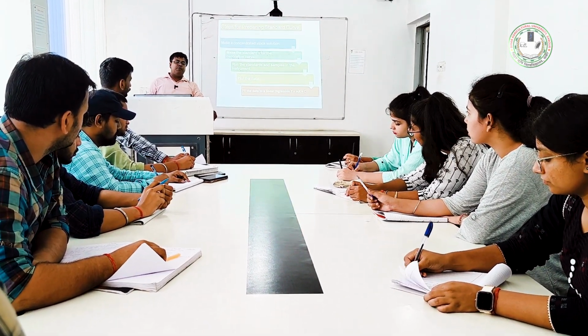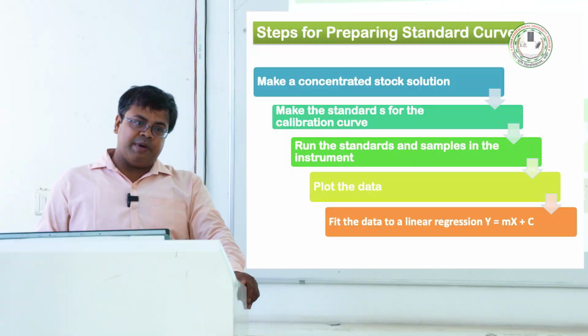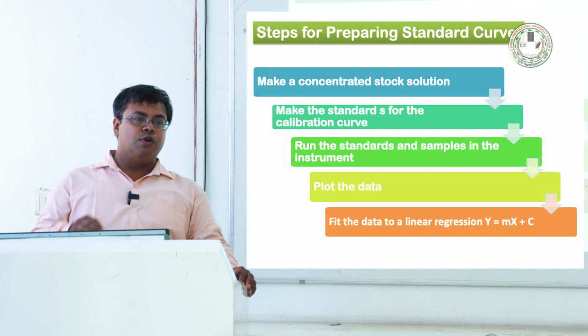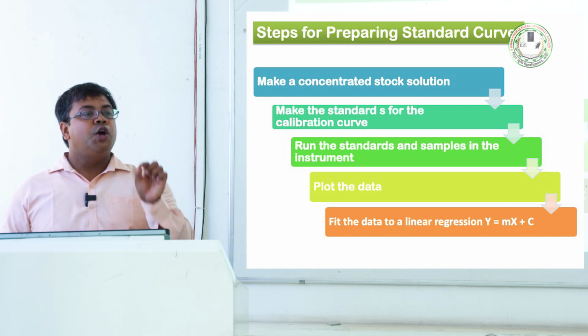But we will take potassium dihydrogen phosphate because it is a primary standard, whereas potassium hydroxide is hygroscopic in nature. Once we open the box or weigh it, it will absorb moisture, so we will not get the actual concentration of the element.